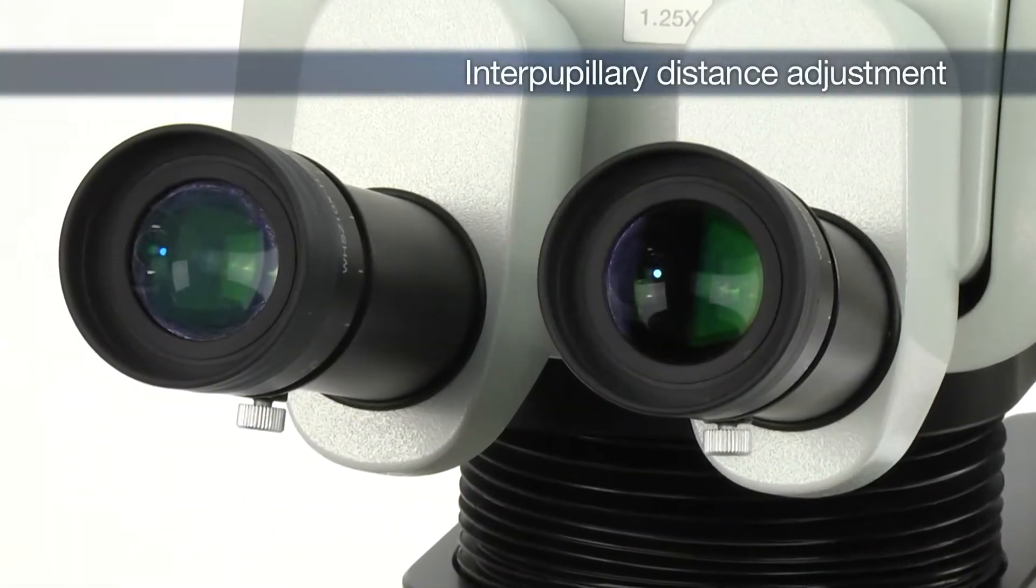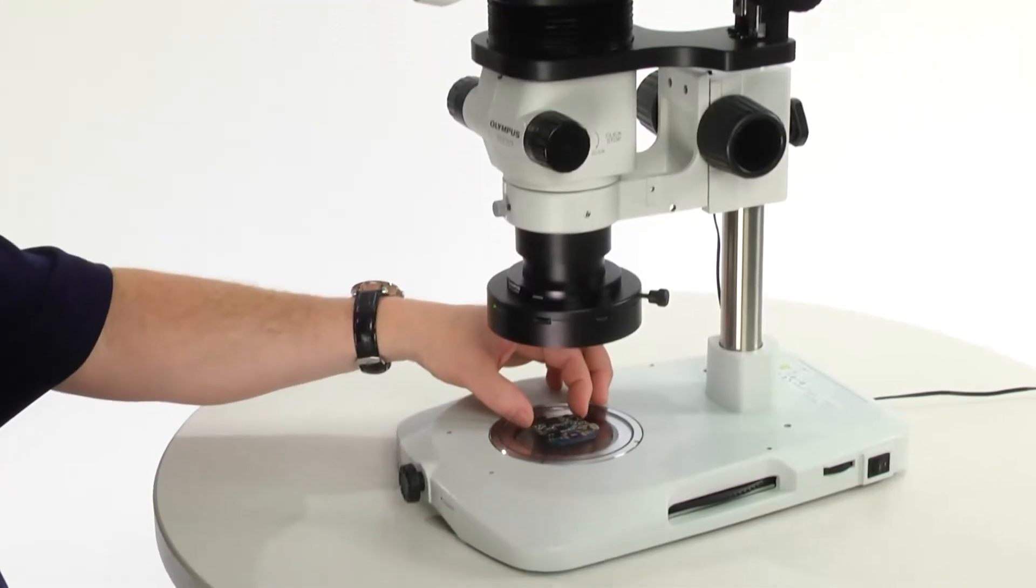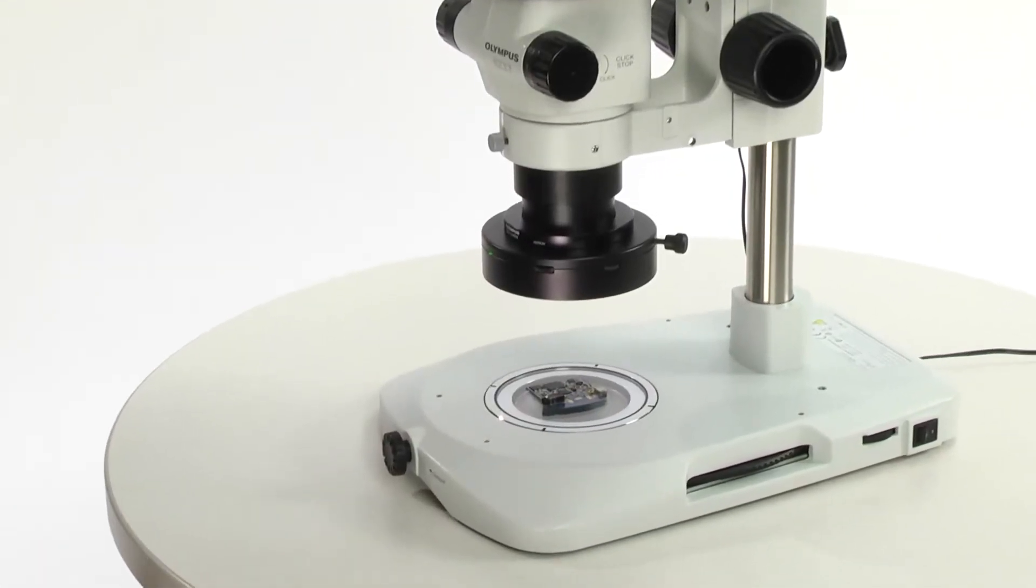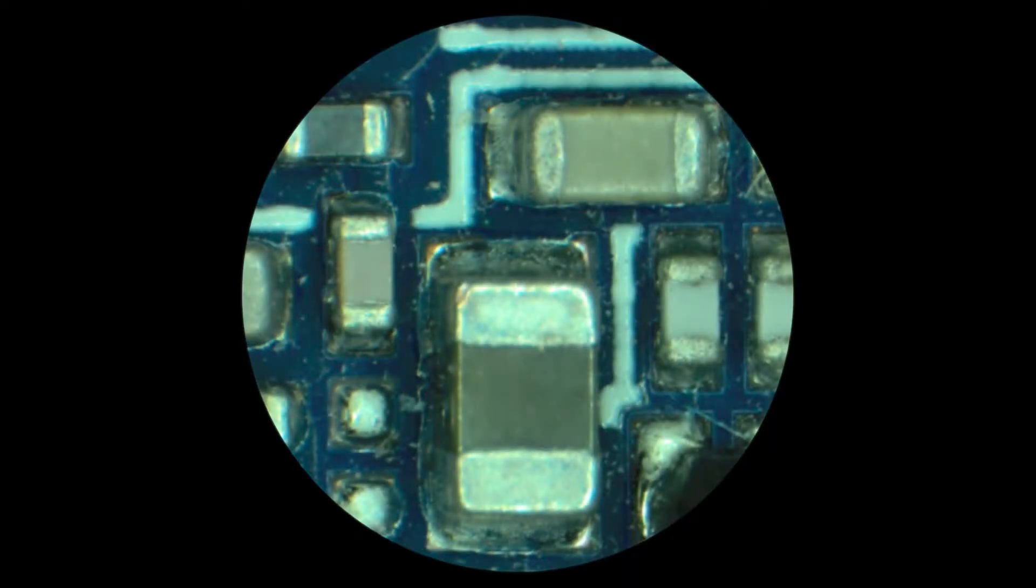Adjusting the interpupillary distance is necessary to obtain proper binocular vision. First, place a flat sample on the stage. Adjust the lighting and bring the sample into focus.